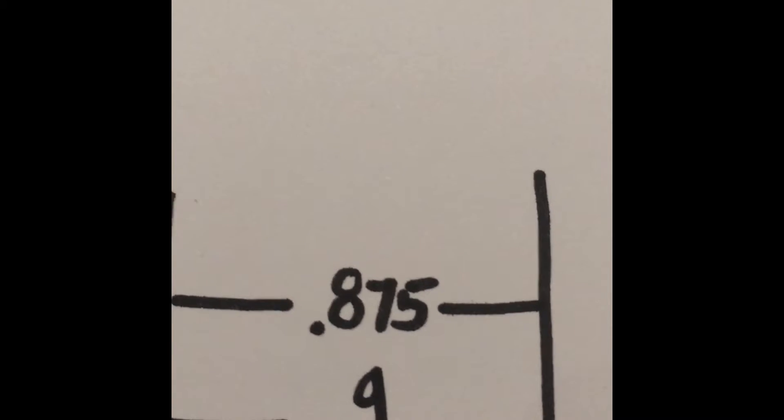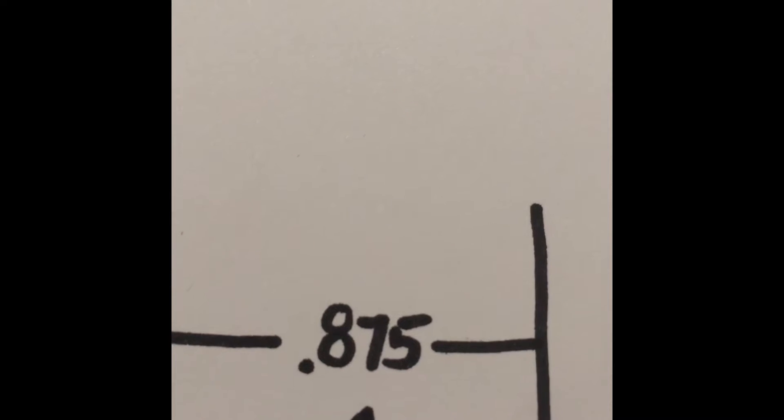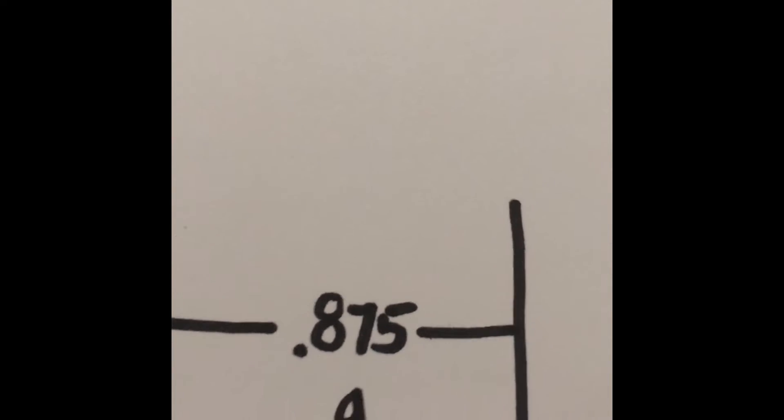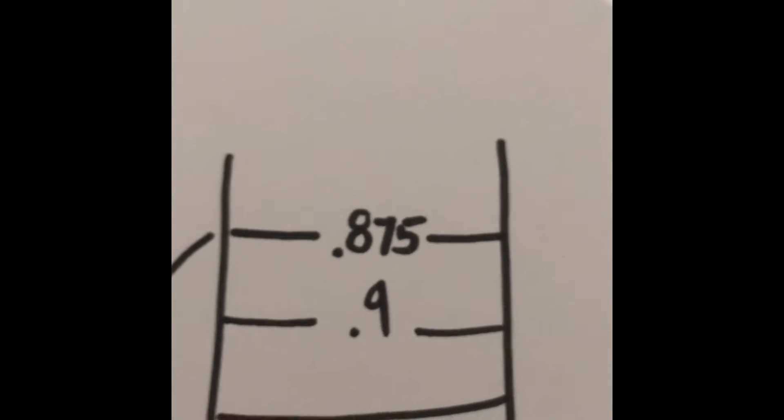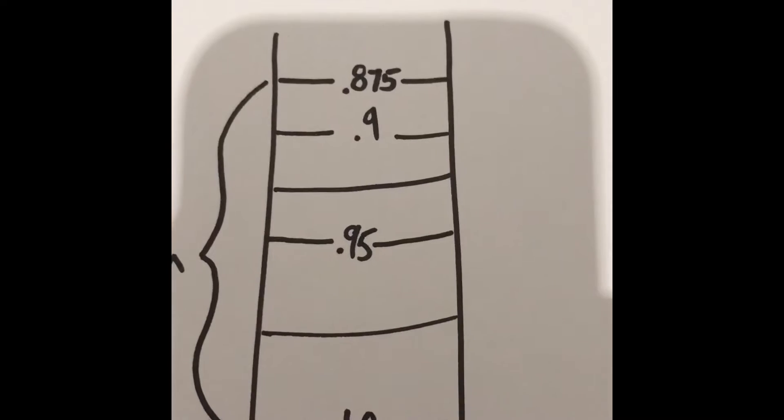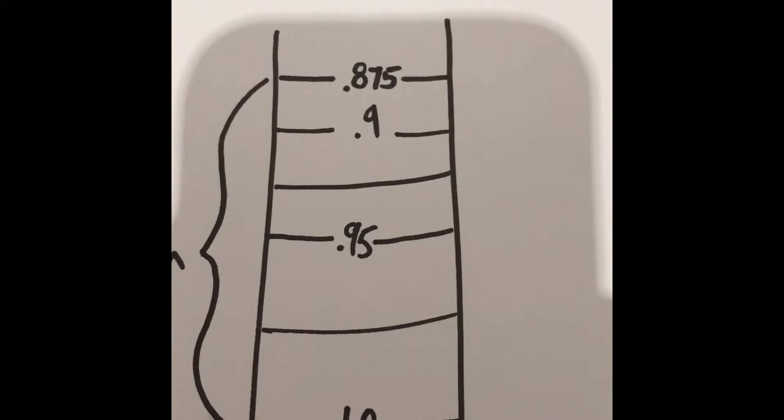Using the number that you just calculated and starting at 0.875, measure down, marking this number 0.9. Measure down again and keep doing this until your scale has 6 numbers.